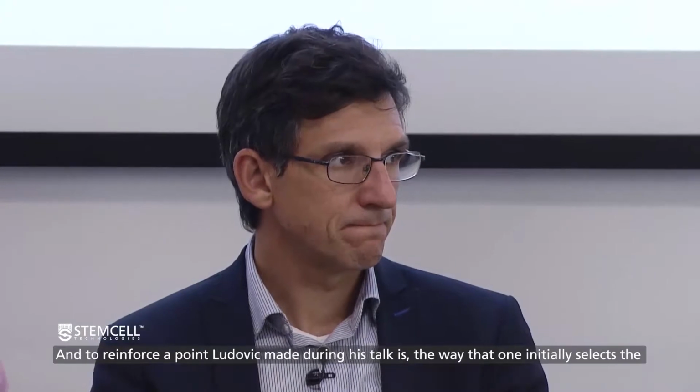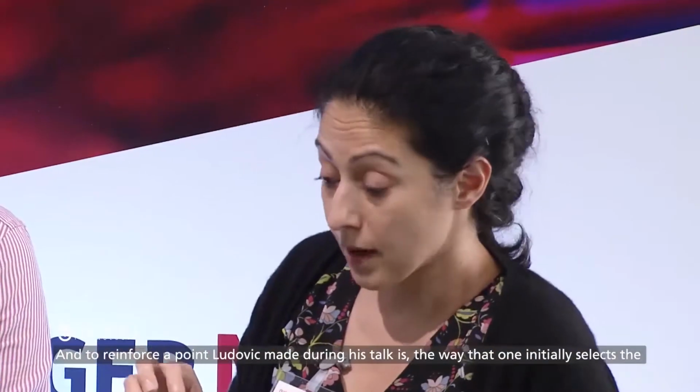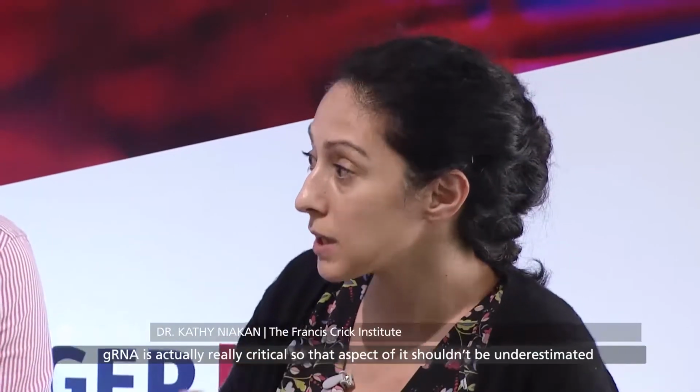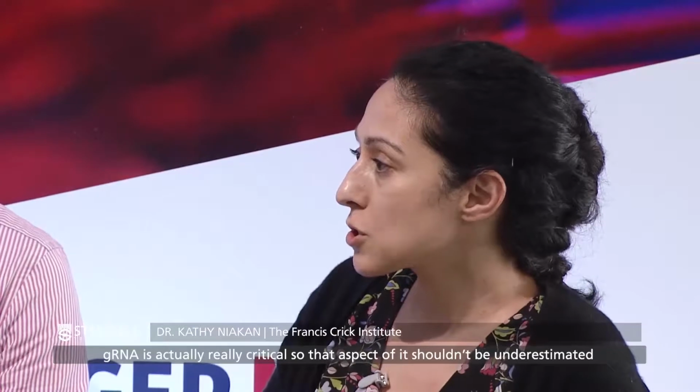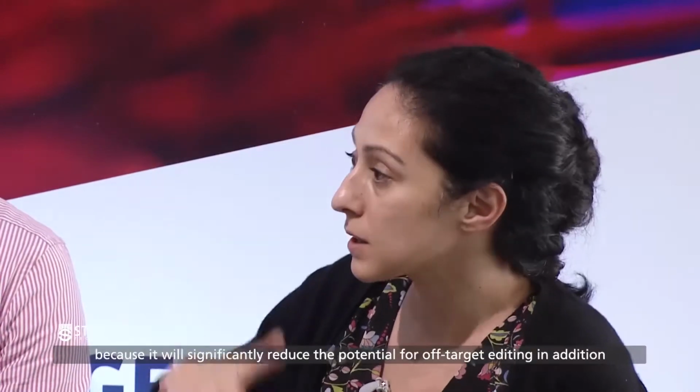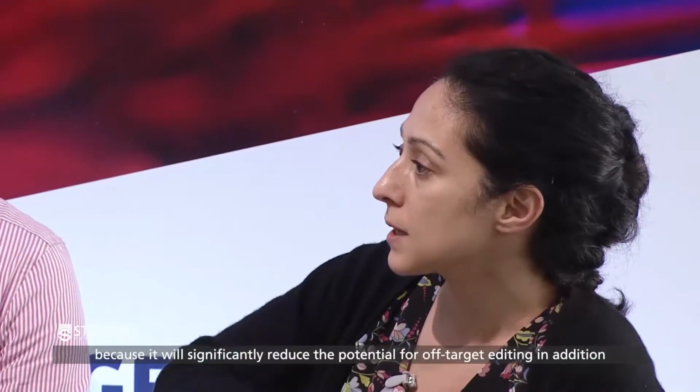To reinforce the point that Ludovic made also during his talk, the way that one initially selects the guide RNA is actually really critical. That aspect of it shouldn't be underestimated because it will significantly reduce the potential for off-target editing.